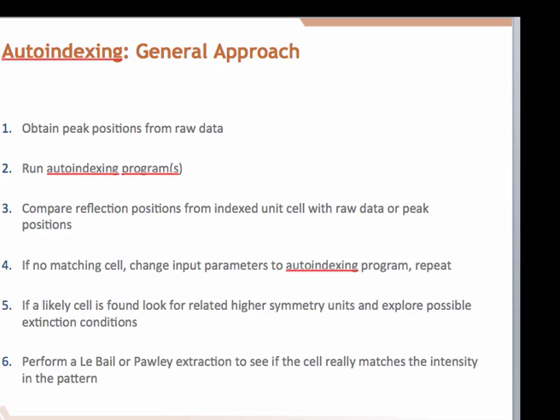And you may want to discard some peaks. Any peaks that look, for example, to have different widths, wider or significantly narrower, are questionable. If they're significantly narrower, they may come from another phase. They could even be peaks coming from a single crystal. So, for example, sometimes on our instrument, working with low temperatures, we will see individual ice crystals forming on the outside of a capillary from condensation.